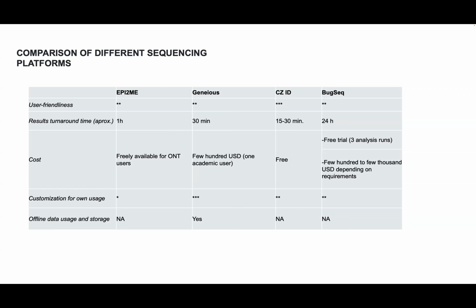So they are quite focused on your needs, so you can talk to them directly, and then you get an offer from them depending on how many samples you want to sequence and everything. And they've got really good compliance and a really good idea behind this last program, the BugSeq. But for the ones who are not using sequencing too frequently and who don't have a lot of money available, I wouldn't recommend this platform.